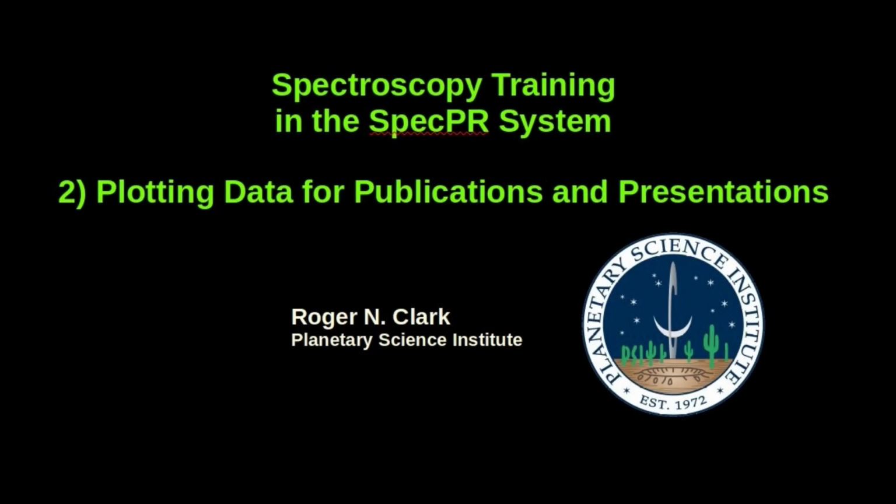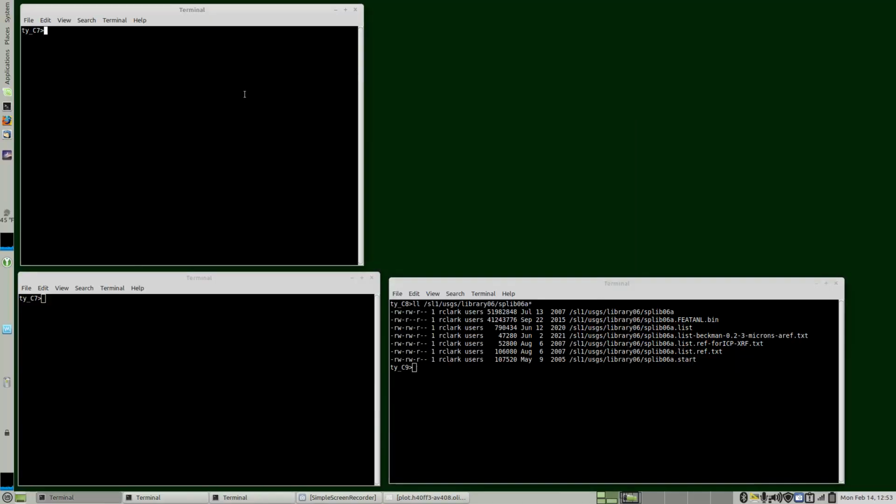In this session, we're going to show how to make plots for publications and presentations. As usual, I've set up a test directory, and I have my alias. So we start Specpr with this command.